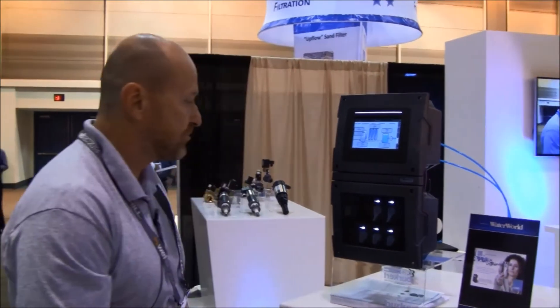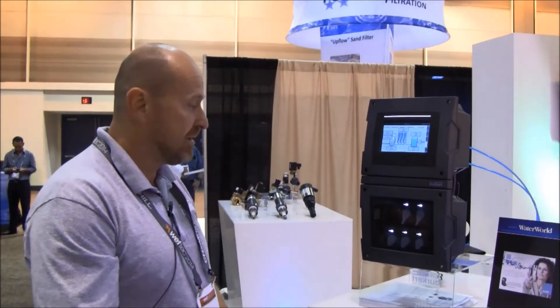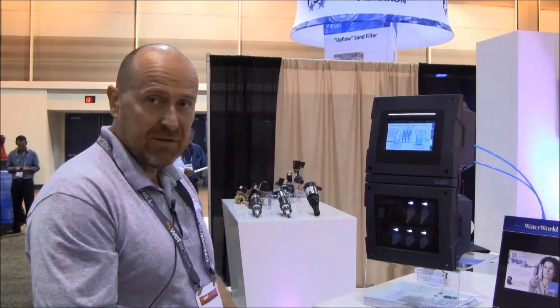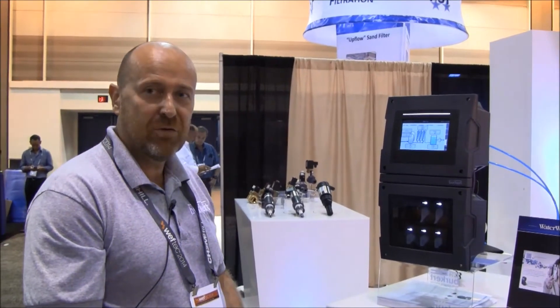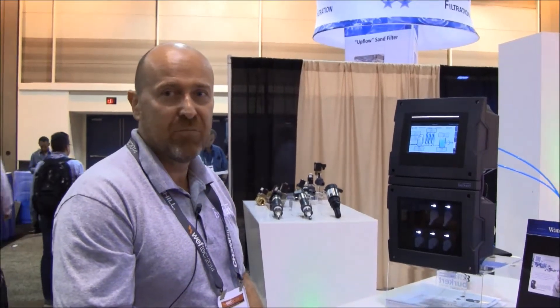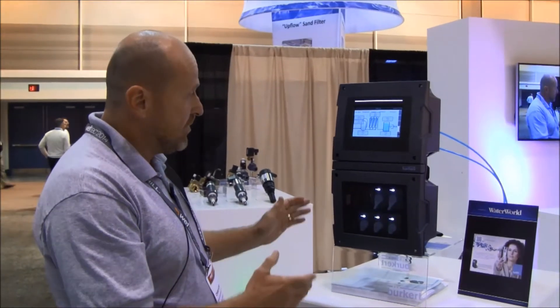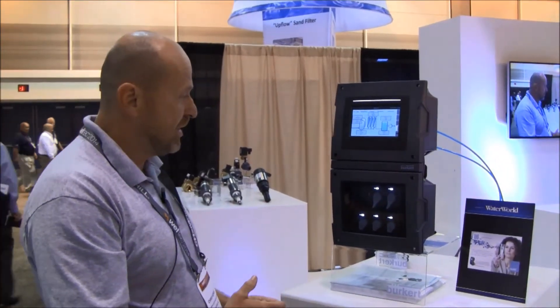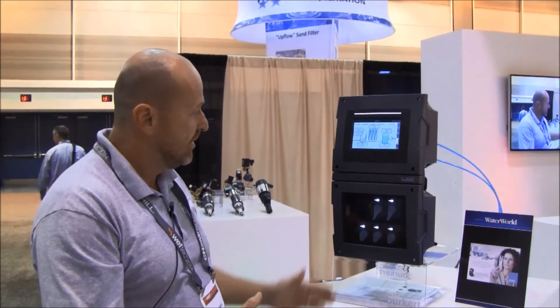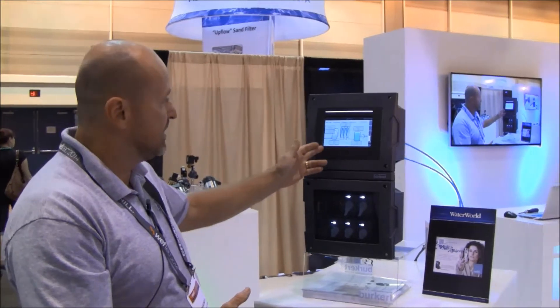The concept. The Burkhard Online Analysis System AD905 is an analytical system for water quality monitoring, mainly for drinking water applications, but you can also use it for processed water if the water is quite clean. It's a modular system in a very super compact housing.